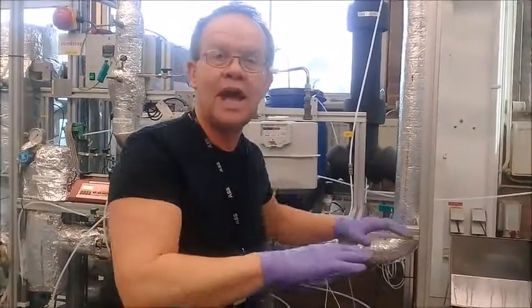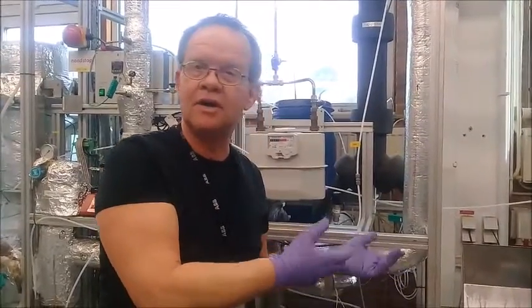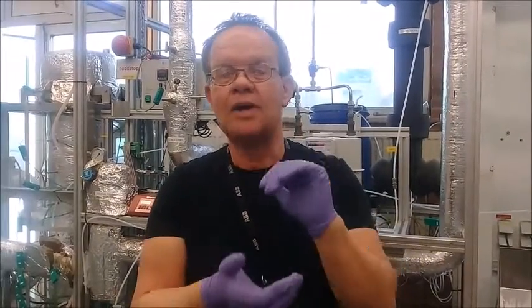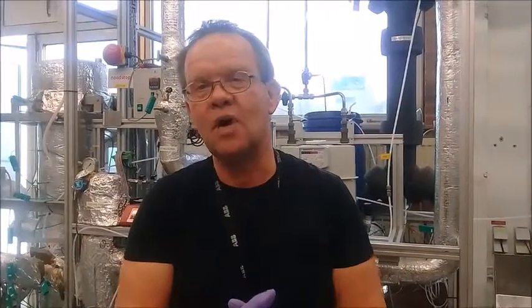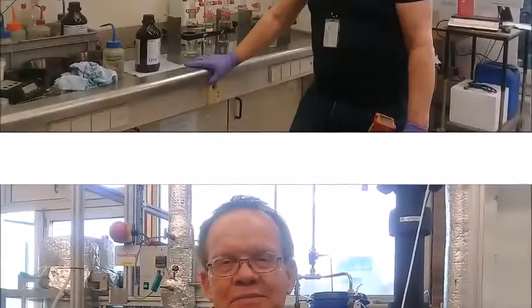Okay, once we have completed the sampling after an hour, so this will run for an hour, then we take out the washing bottle racks from the baths, and we'll bring them to the fume hood, in which we collect all the samples together. So we put all the 6 bottles together, and we create one sample of about a liter of isopropanol, and that isopropanol will go into the organic laboratory for further analysis. So that's about it, how the guideline works. Thank you very much.